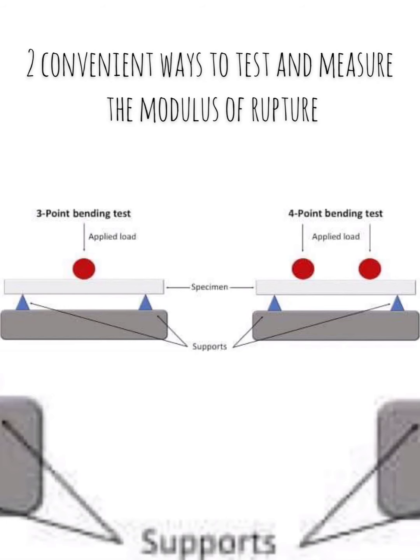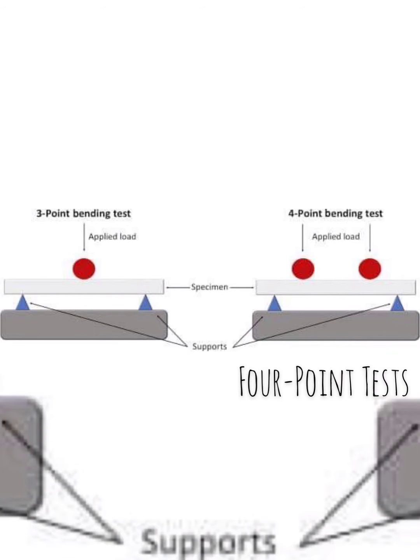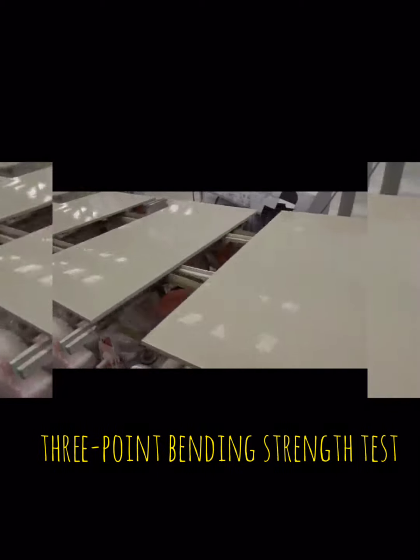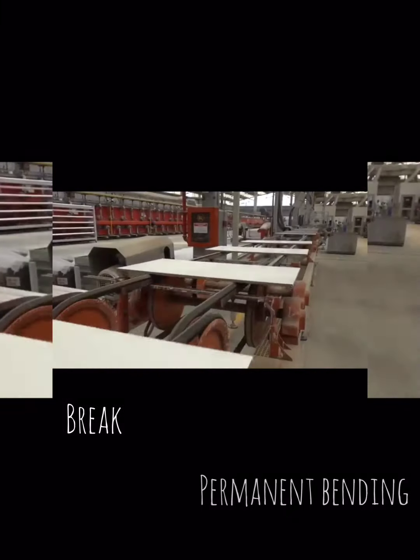But how is flexural strength or modulus of rupture determined? There are two convenient ways to test and measure the modulus of rupture, through a 3-point bending test and a 4-point bending test. For a 3-point bending strength test, a continually increasing load is applied in the center of the sample until there is a break or permanent bend in the material.